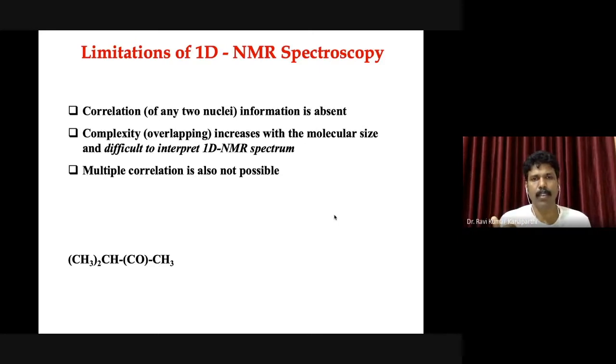Why am I saying all these molecules? Just imagine what the chemical shift values of the methylene and methyl groups in these alcohols will be. They will all resonate more or less at one place, right? Methylenes, and then the terminal methyl groups. Now, as the size of the molecule increases from ethanol to hexanol, the complexity increases in a certain region in the NMR. Am I right or wrong?